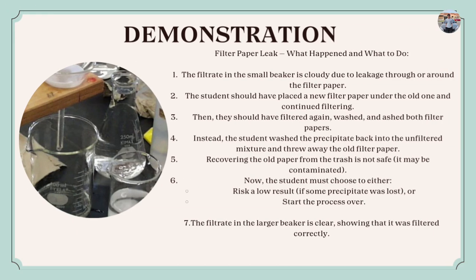The fourth demonstration, filter paper leak: what happened and what to do. The filtrate in the small beaker is cloudy due to leakage all around the filter paper. The students should have placed a new filter paper under the old one and continued filtering. Then they should have filtered again.